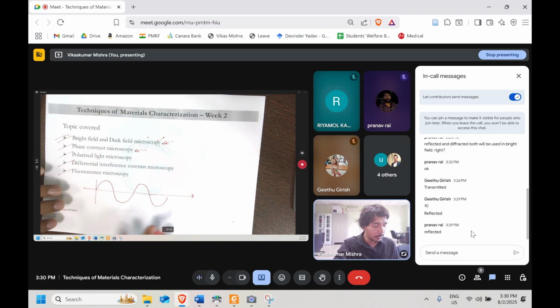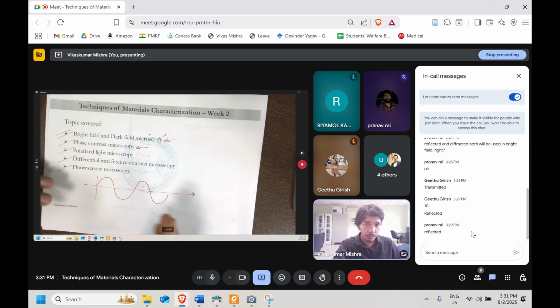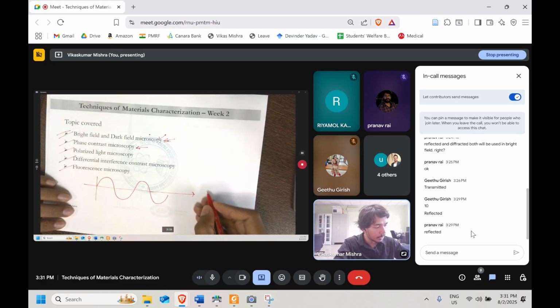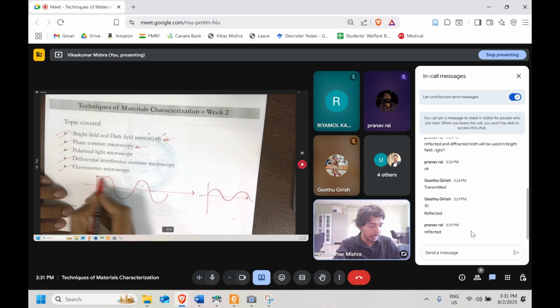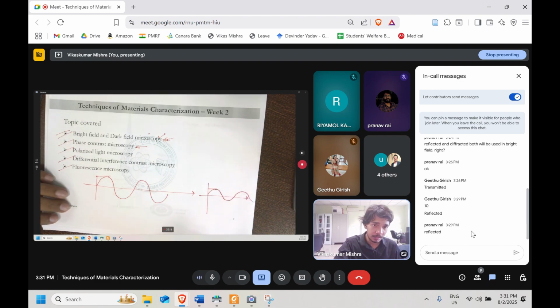In the dark field, the intensity is getting down. So if I'm talking about the final wave, the amplitude will get down. Whatever amplitude I had here, the amplitude will be less, because the diffracted beam has less intensity. It's the group of waves combined together to interfere that gives us the intensity which is visible.